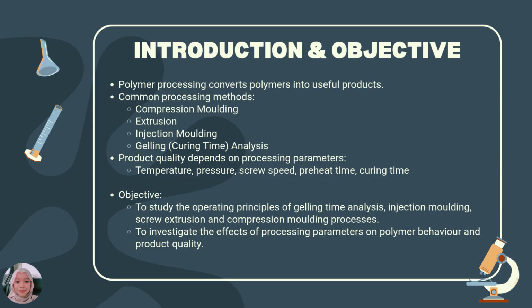The objective of this laboratory is to study the operating principle of gelling time analysis, injection molding, screw extrusion, and compression molding process. Second, to investigate the effect of processing parameters on polymer behavior and product quality.